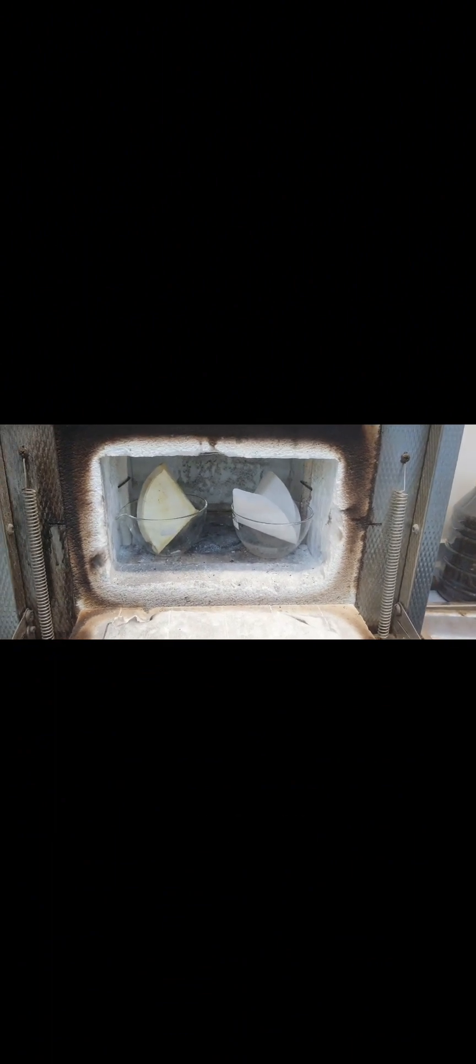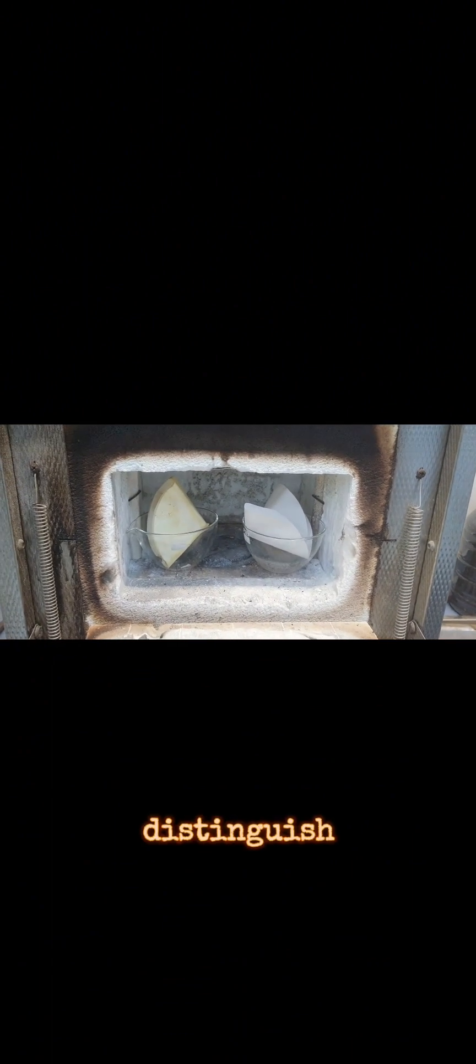I kept the two samples here. This is my first sample and this is my second sample. After burning it will turn to ashes, so it will be difficult to distinguish, so I'll remember.